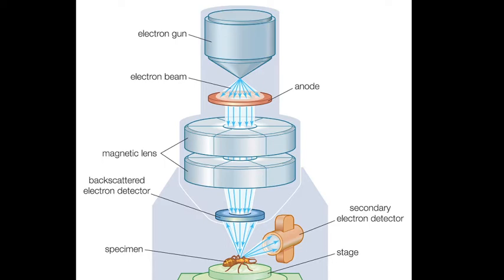So in the structural determination and the structural analysis of nanomaterials, we can use two types of electron microscopes. One is the transmission electron microscope and another is the scanning electron microscope. So in the case of the scanning electron microscope, using this one, we can study the surface image of that particular specimen. We will get the surface image of a specimen.